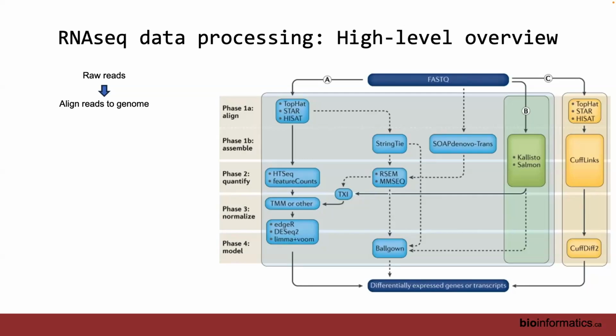An aligner needs to have index files for whatever genome you're aligning to. So if I'm a lab that does mouse work and you're a lab that does human work, I'm probably going to have the indexes set up for mouse. And if it's a very common aligner tool, you can probably download the human index from somewhere on the internet, right? For the right build of the human genome, GRCh38 or whatever. I don't know what you folks do in metagenomics. Yeast cell, yeah.